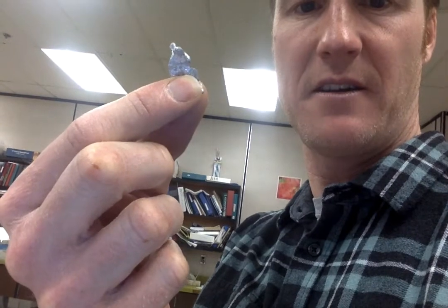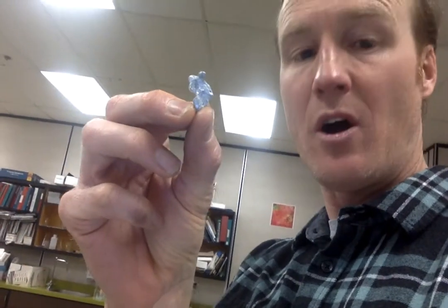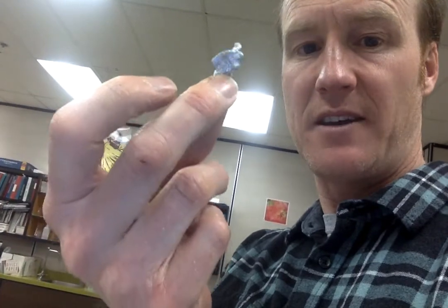I'm going to show you the ingredients. Chemistry is a lot like cooking. Here they are for part A. This is zinc metal. You might want to make some observations about what this looks like. Science 9, this is a typical metal. This is hard, malleable, shiny, things you might think about in your observations for this lab.